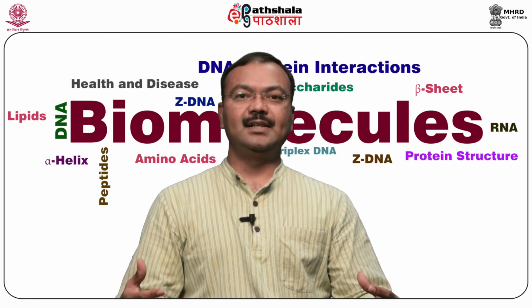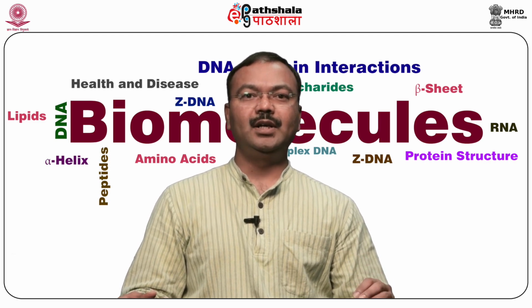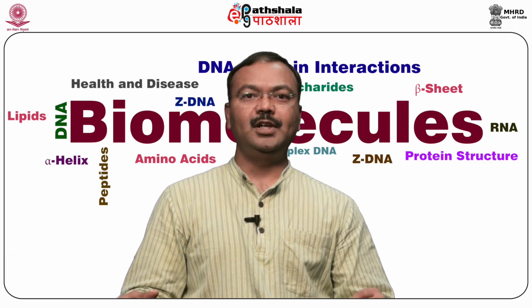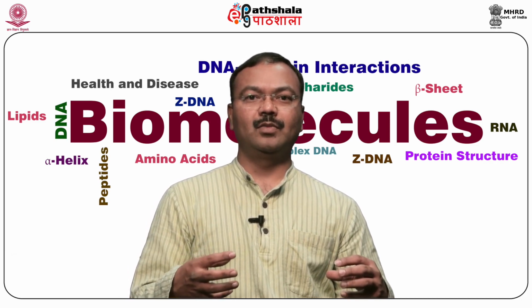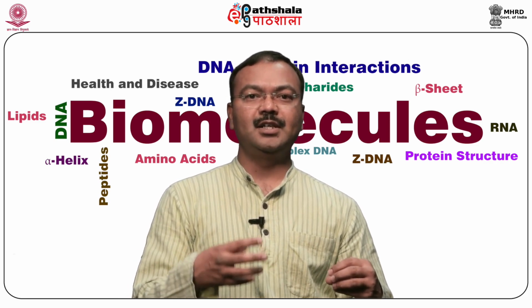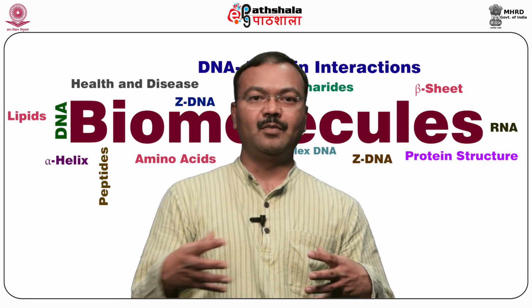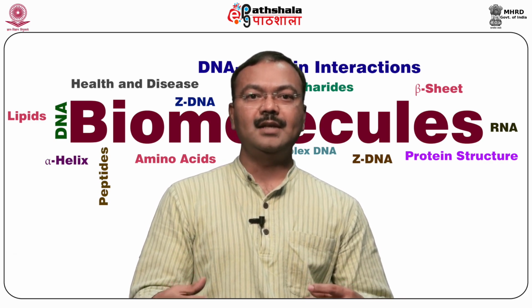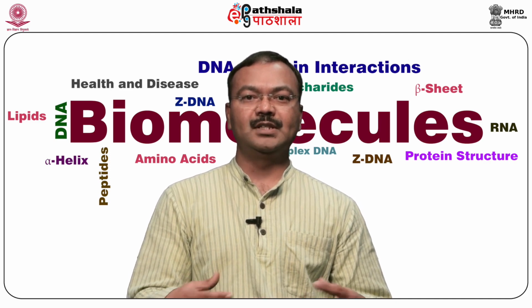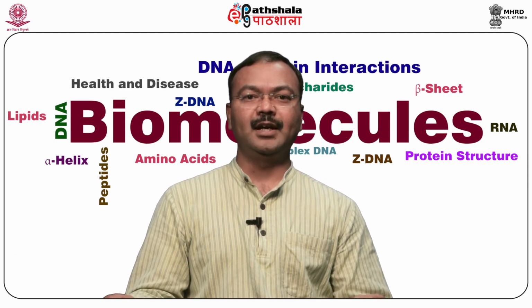How is this NMR signal detected? After the magnetic pulse, the nucleus returns to its ground energy state. The nuclear process of coming back to the native state induces a current that is detected by a coil in the NMR spectrophotometer. As the nuclei return to equilibrium, the induced current decreases back to zero. This is called a free induction decay, and this is what is measured using the NMR spectrophotometer.